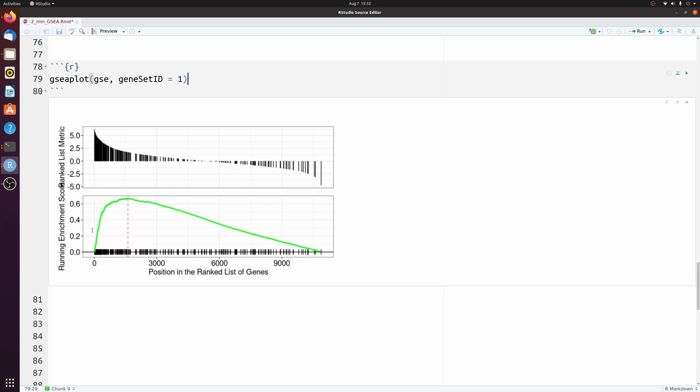And then the running enrichment shown in green increases when there's a lot of genes close together. And then you can see it falls off as the genes become more sparse in the list. And then the enrichment score will be the maximum of that.